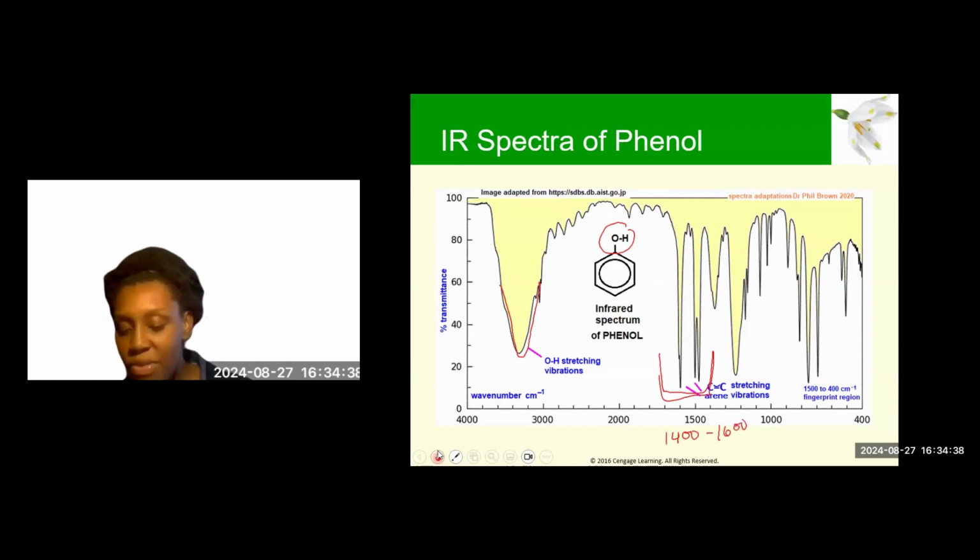And so you still have that as well. And then also you have that carbon-hydrogen bond. You can see this peak here. It's not labeled, but that's the carbon-oxygen bond there. So whenever you see a broad OH peak and some activity there, you're able to identify that as potentially a phenol.